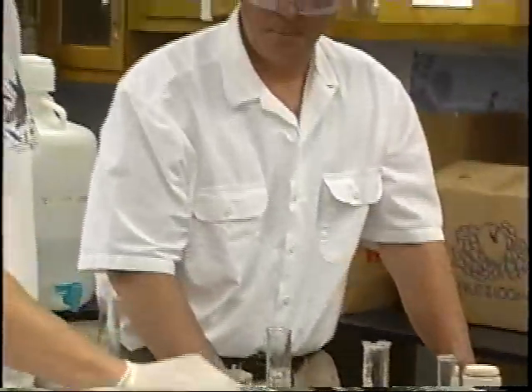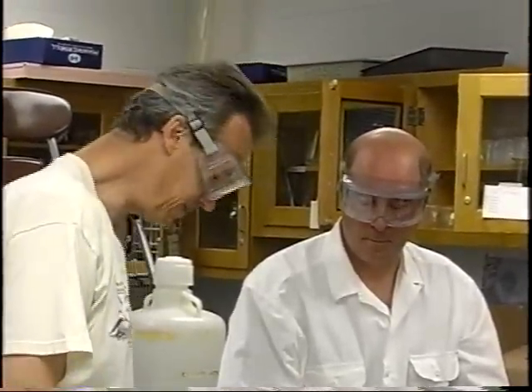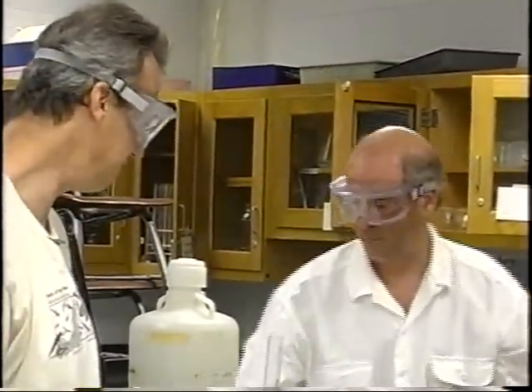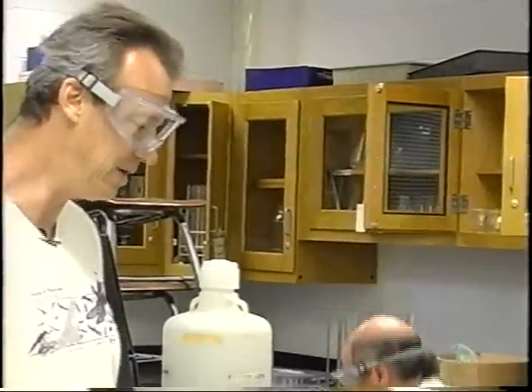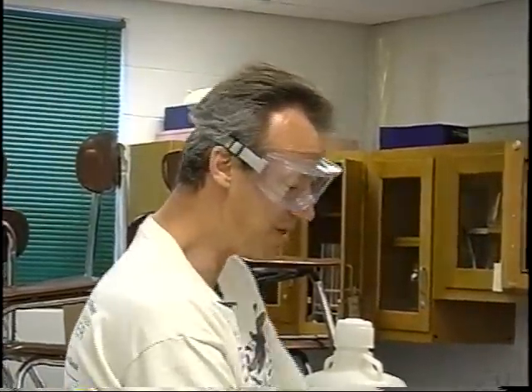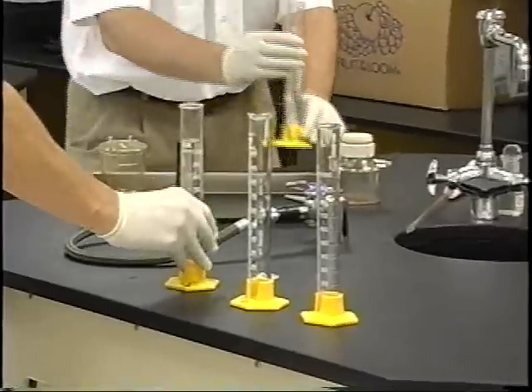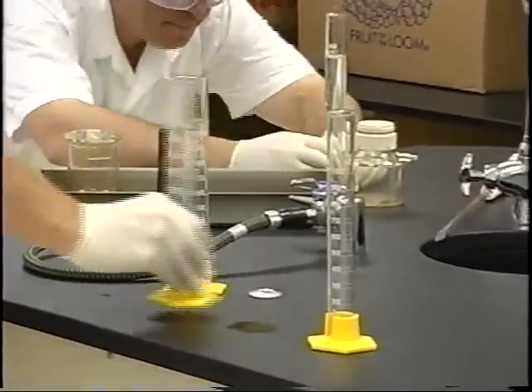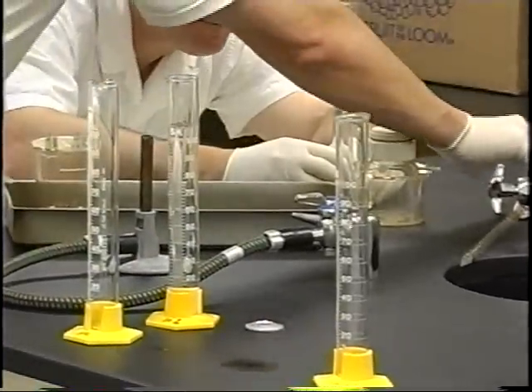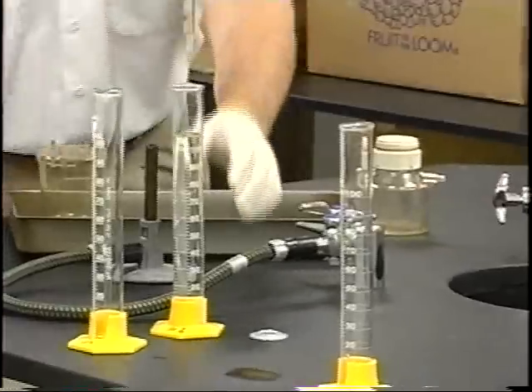Now we still have 2 more samples to use. What we're going to do now is a pretty simple thing. We need 99 mLs of deionized water again. What I'm going to use now is this sample. There's still river water in here. So what I'm going to do is take 11 mLs out of here, transfer it to here. Once I get this one made, I'll do that yet another time. So I can go ahead and add this. You always want to add this first, remember.